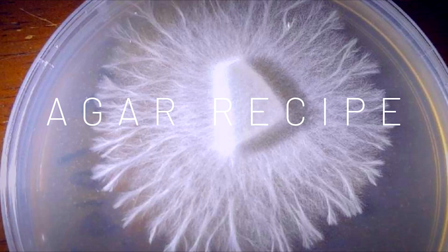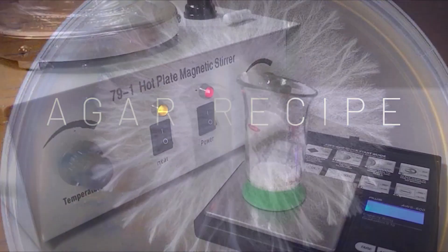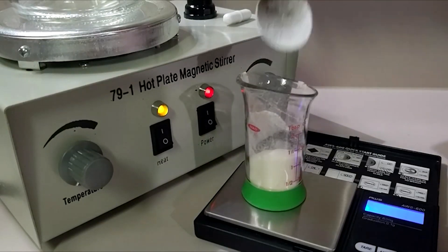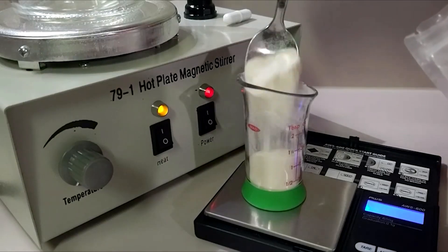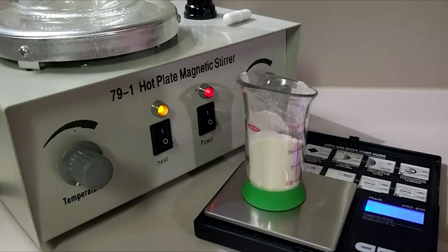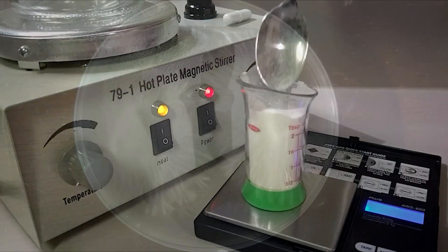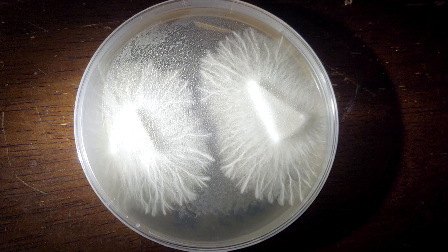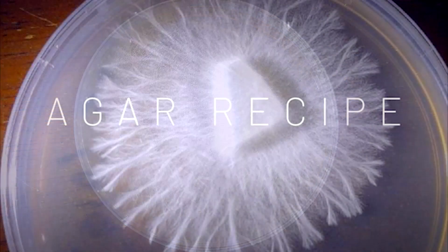As this process evolves, you will add nutrients to further encourage rhizomorphic growth so you can clearly tell where the best entry points for transfers are occurring. We have discovered that less nutrients seem best for rhizomorphic growth. If you starve the mycelium, it branches out to search for more nutrients, resulting in a branched look similar to a root system. The more nutrients you add, it spreads out in a more fluffy tomentose style.